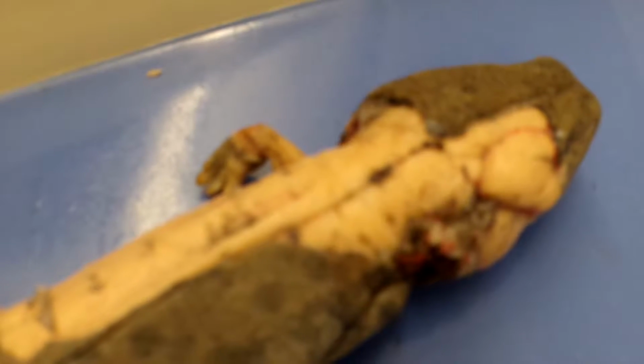The next muscle is the rectus abdominis, which is found here, and its anterior pubis rectus. Its origin is the anterior pubis, its insertion is the rectus cervicis, and it is homologous to the hypaxial muscle in the shark.